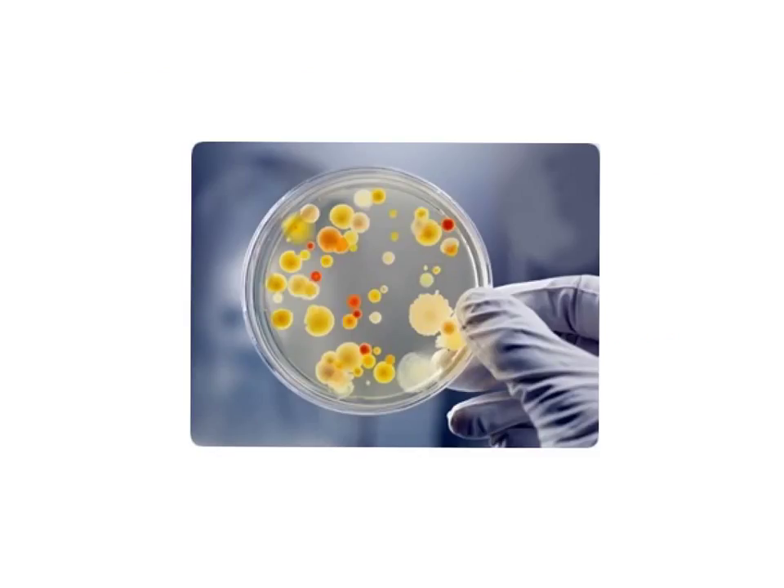Here's the result. What you can see are colonies of bacteria of all sorts of different colours — yellow ones, orange ones, red ones. Each one of these is known as a colony, and each colony will contain thousands, tens of thousands, even hundreds of thousands of bacteria of one sort growing there. We don't always see the streak that we put on there, as some parts may not develop bacteria, but it does give you an idea of how many bacteria there are and how many different sorts of cultures.